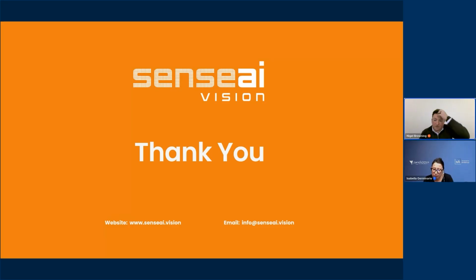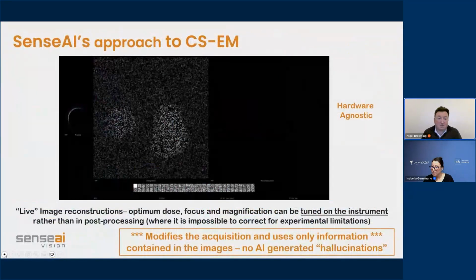Okay. All right. So I'm trying to translate that. Essentially we don't put a model into the reconstruction. Now the sampling map that we use is essentially determined to be random. Random is in the eye of the beholder to some extent, but mathematically, as long as you don't have a uniform spacing of your pixels and a uniform set of directions, you can generate a random map. And that's the one I was showing in terms of this random walk. What that is then doing is learning from the image, informing these dictionary elements.